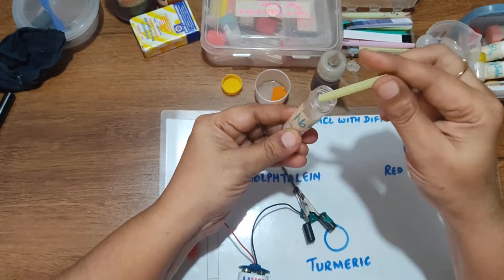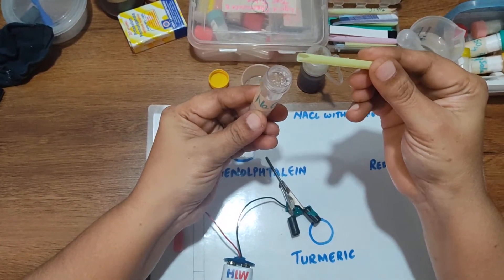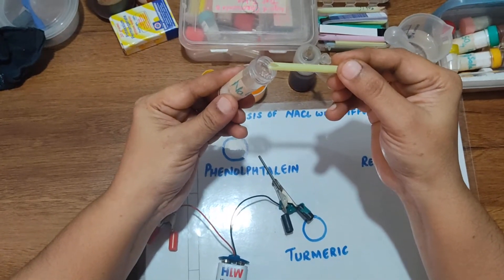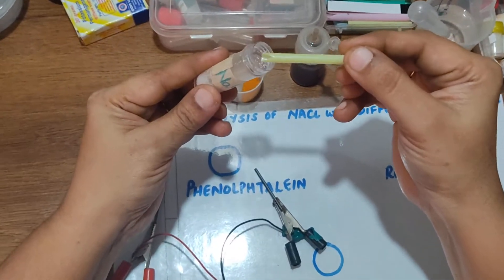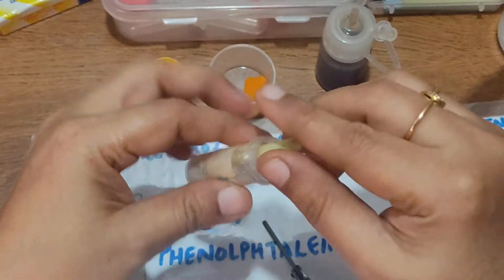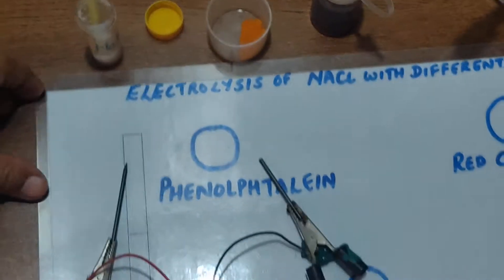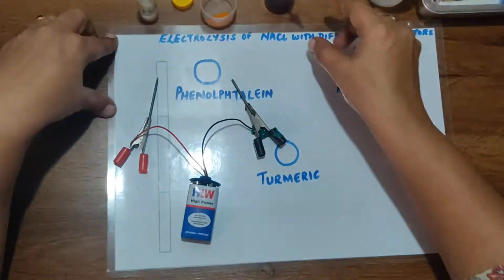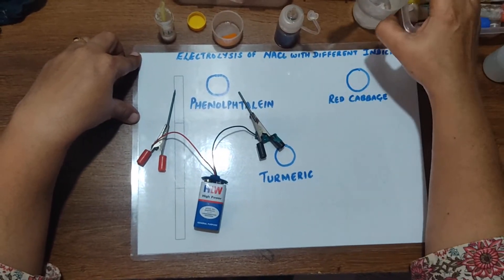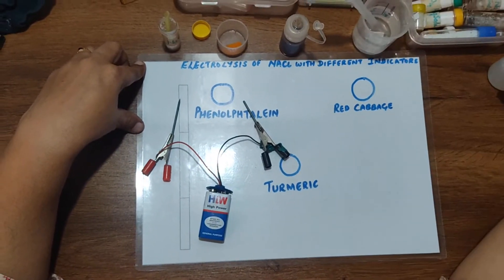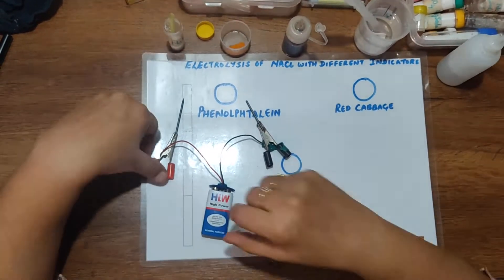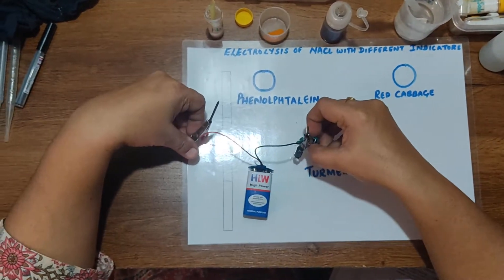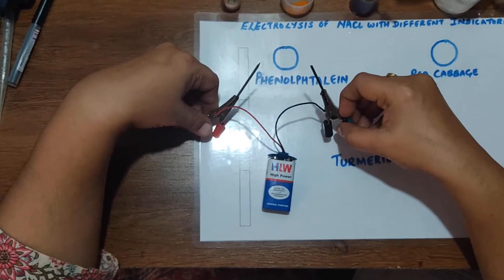I've made this straw into a spatula. This is very useful to transfer micro milligrams of the chemical required. This is a laminated sheet on which I'm going to perform the experiment. This is turmeric and this is the red cabbage indicator. I've taken some water and phenolphthalein indicator. I have a nine volt battery, a cap, and two graphite rods which I've taken from the pencil.